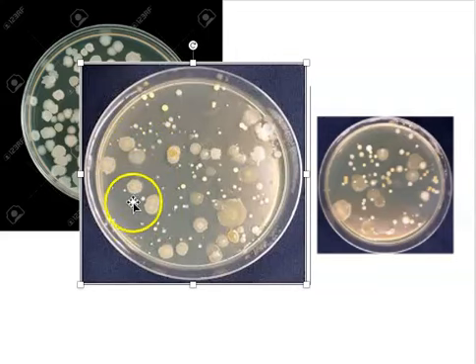See how the center of the colony is just a little bit more white than the rest of the colony is? We have that organism growing. We also have some organism growing as a small white colony. We also have an organism growing as a larger white colony. We've got something over here with a rhizoid shape. Lots of different kinds of bacteria growing on this plate.